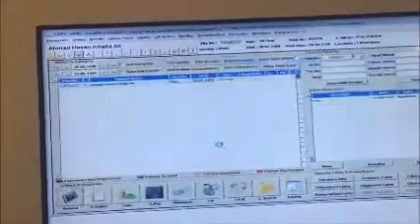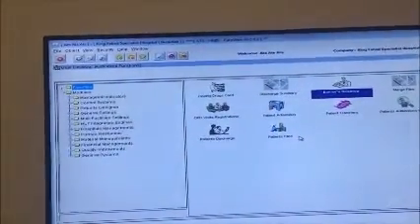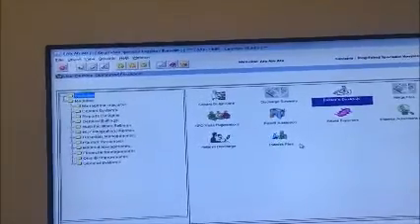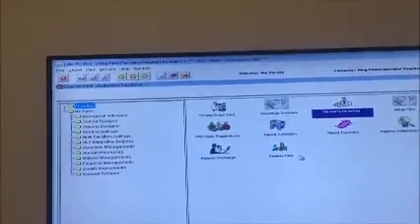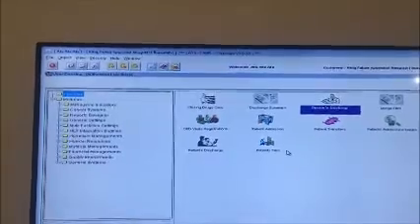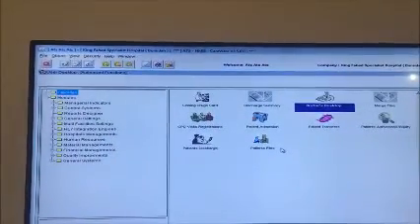In this case, for example, we are still waiting for the result from CBIS for the procedure, and now I am just doing an order for the lab. I need to do a collect and insert the result to send it to the lab.